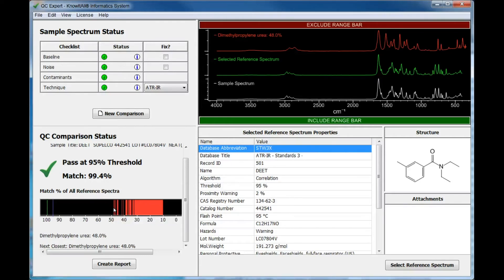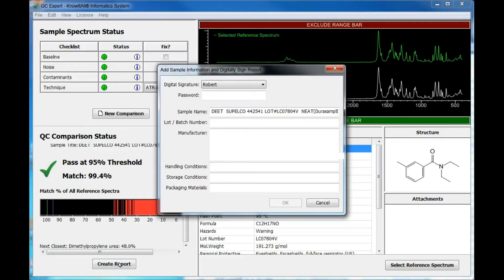Next, click Create Report. You must provide your digital signature and password. If you have not installed the PDF signature certificate on your system, you will be prompted to do so. The sample name appears automatically and other information can be added if you wish.